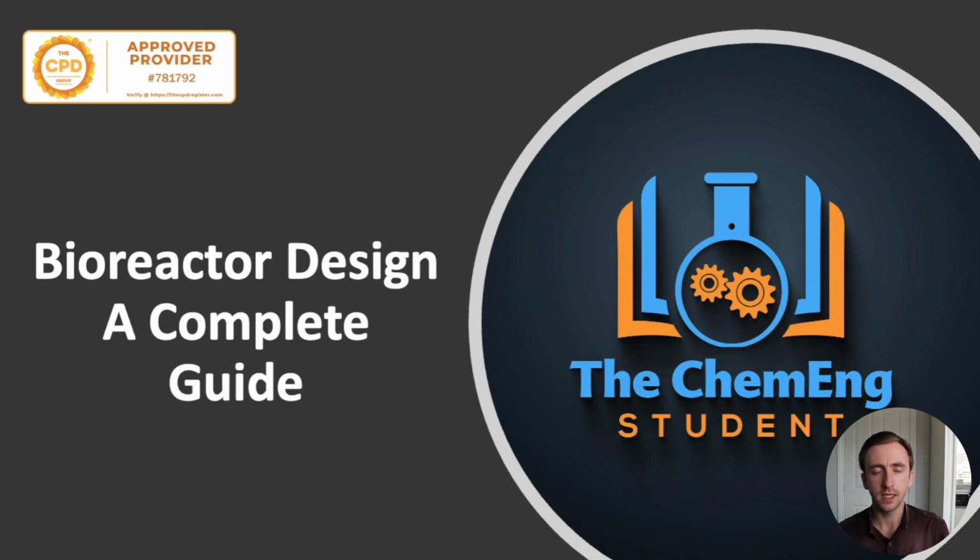In this lesson we're going to take a look at the complete design of a bioreactor and all the key parameters associated with microbial growth and how they influence bioreactor design.